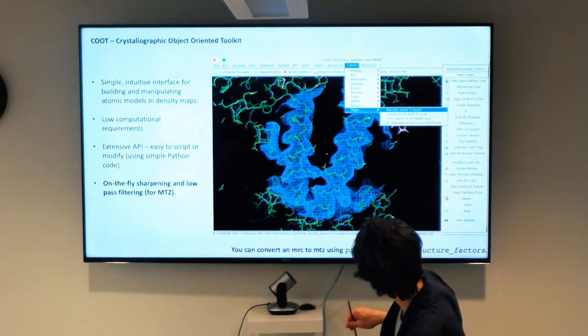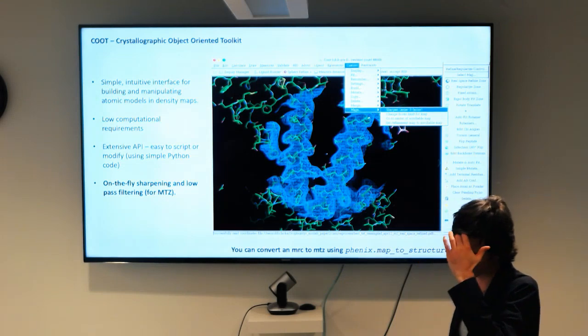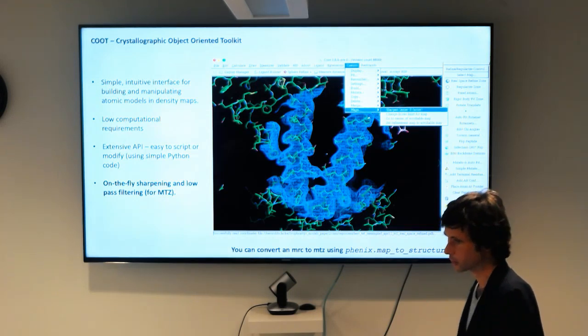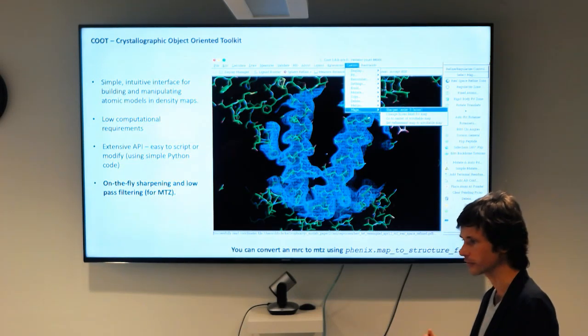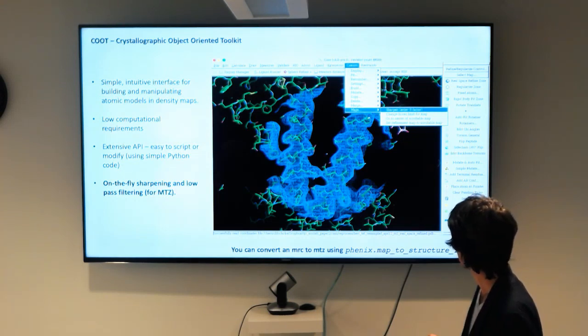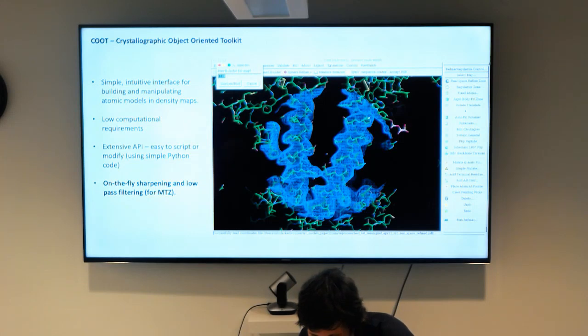So in my COOT Trimmings package, it'll give you a new custom menu, which should show up and has a bunch of different tools that you can use for visualizing your protein, like custom coloring by hydrophobicity, coloring by finding particular sequences, a lot of different things. If you want to use it, give it a go.